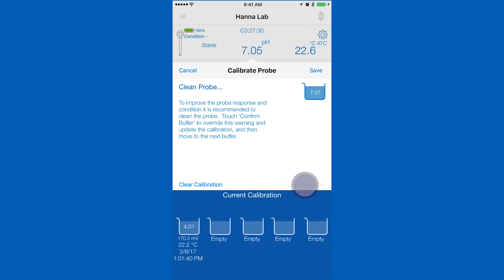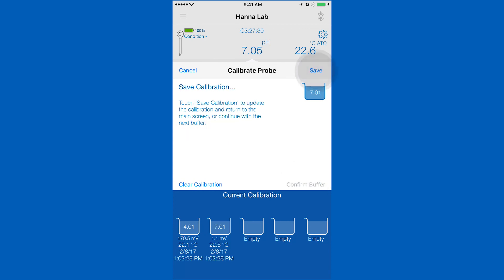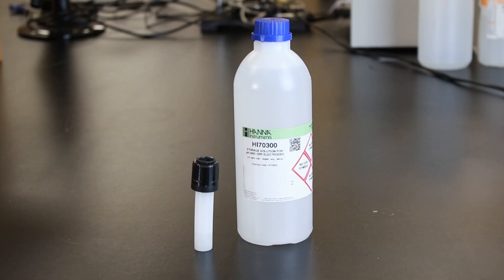After you've calibrated your desired points, hit save to return to the measurement screen. Now that you've calibrated, you are ready to begin taking measurements. When you're not using your pH probe, keep it in storage solution.